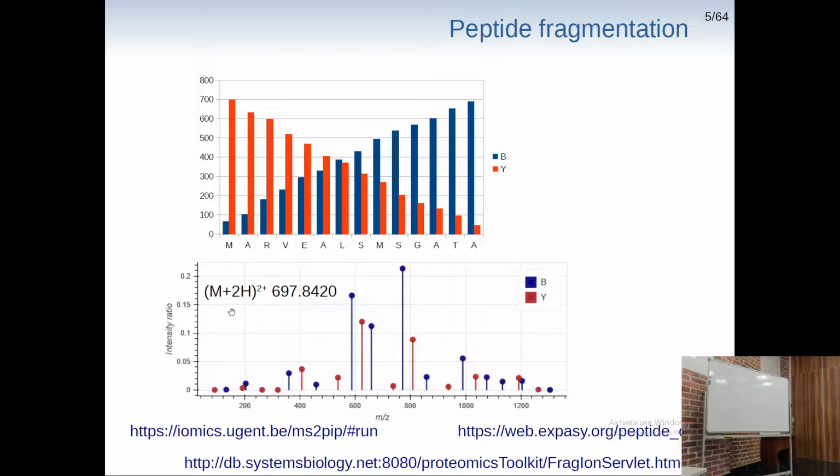And we've also discussed proline, which can stay without charge, and if it is not charged, we can't detect it, right? We'll have just some loss in mass between two peaks, but it could be proline and it could be something else.